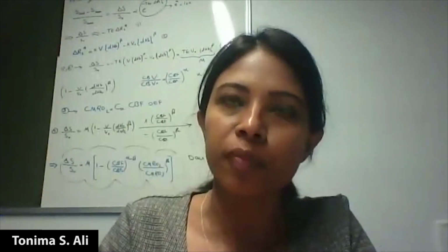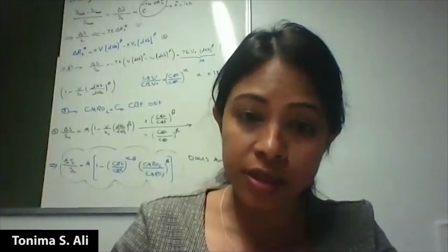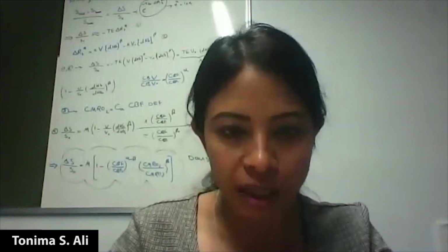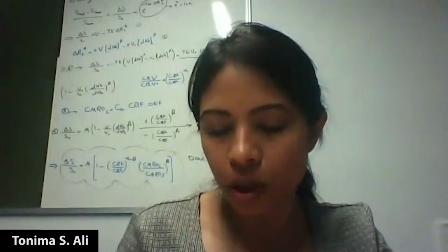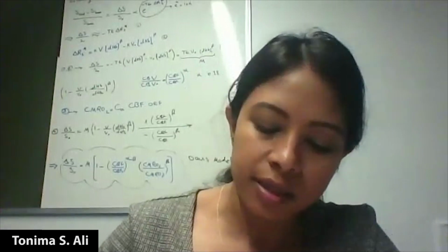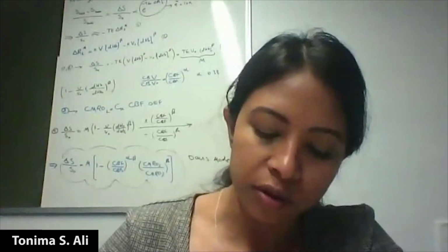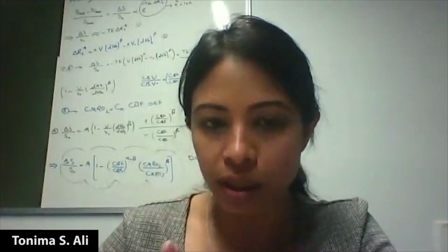We explored different methodologies because, for inverse Laplace transform, the basic algorithm is the same, but the software or the particular script that's used has been developed in different labs in different ways. So we chose the one that allows you to draw a curve that would plot the relative amplitude of the chi-square against the alpha. When we stumbled upon a relaxation distribution for NMR-MOUSE one, the particular advantage we had was there were a lot of relaxation data points, so it was relatively easy to do the analysis.